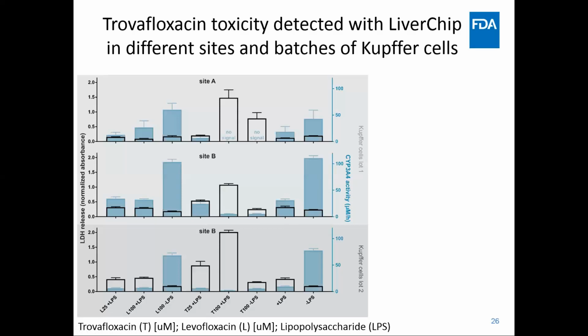So this slide shows that the same experiment done in different sites with different batches of Kupffer cells can result in similar data, therefore suggesting that this system is reproducible, at least for this specific context of use.